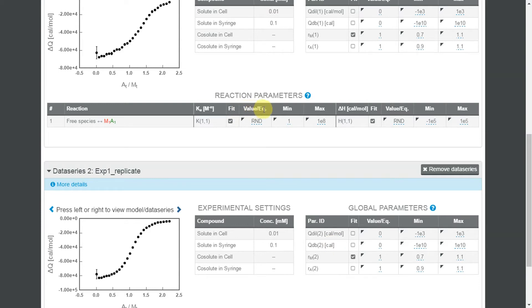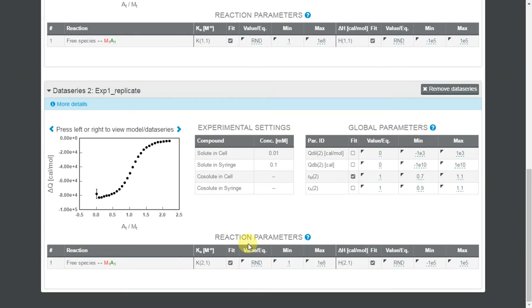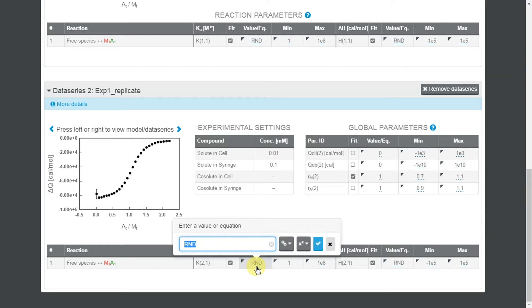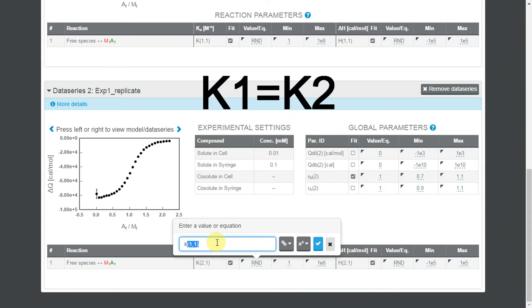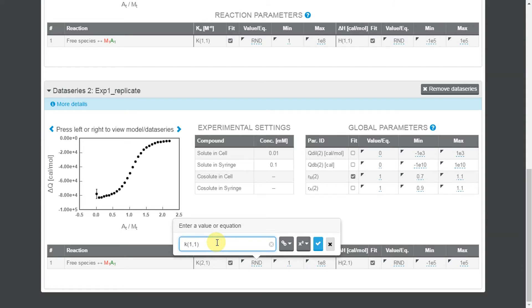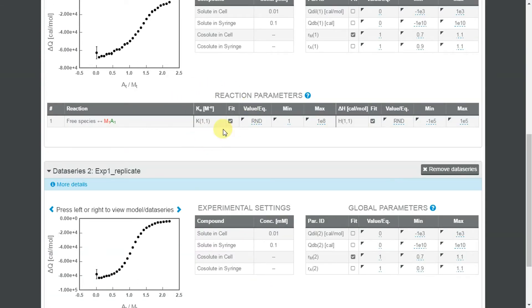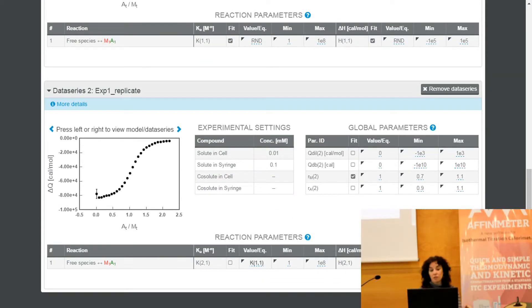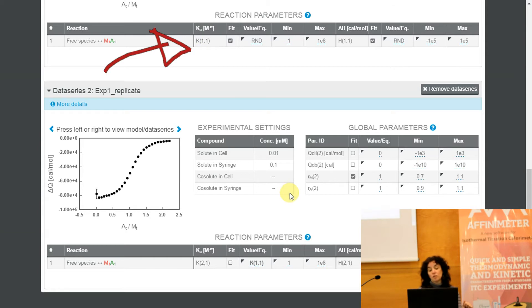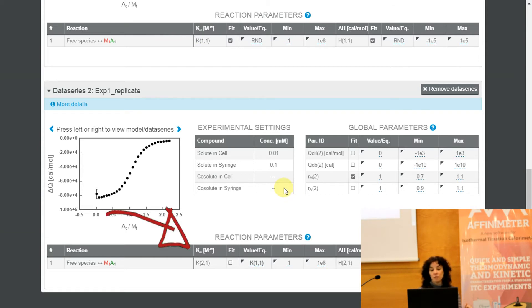For this we have to go to the Value Eq box of one of the isotherms. Let's go to the Value Eq box of the binding constant of the second data series. Clicking on this box, a new window will pop up where I can write down whatever I need. In this case I am going to write k1-1, which represents the binding constant of the first isotherm. With this restriction I am imposing that the binding constant of the second isotherm k2-1 has to be equal to k1-1, which corresponds to the first isotherm.